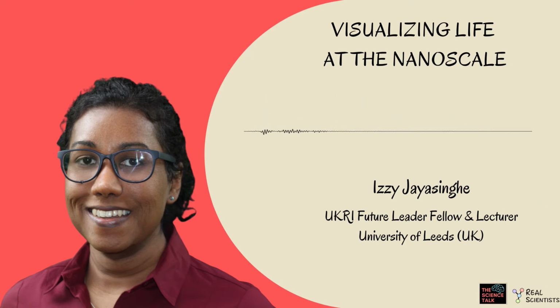I will start probably by introducing the idea of super resolution microscopy. It's an idea that won the Nobel Prize for Chemistry in 2014. So I think it's one of the main innovations in nanotechnology, I would say. And that will be perhaps Monday. And then the next day, I would go into the specific types of super resolution microscopy that have emerged. There are quite a lot of very different methods, and they are all focused on the idea of imaging structures in that nanoscale.